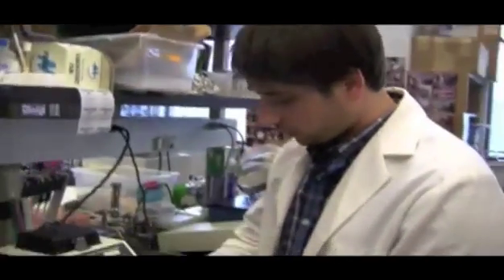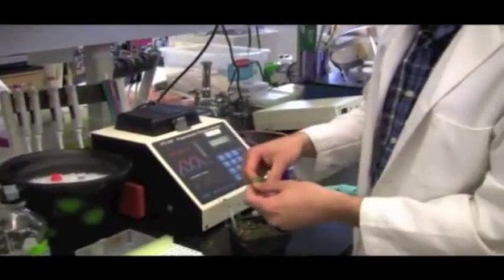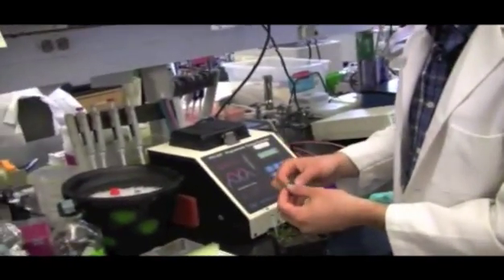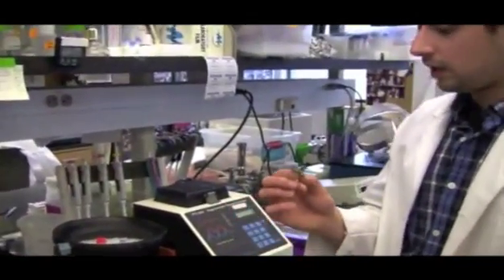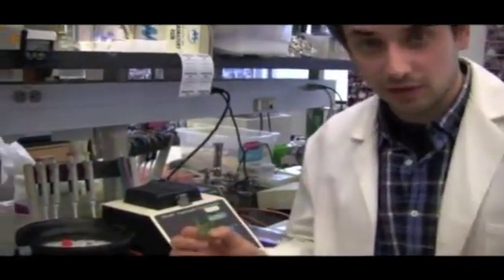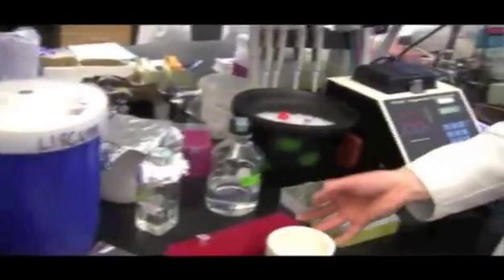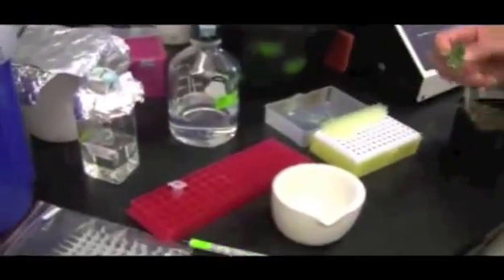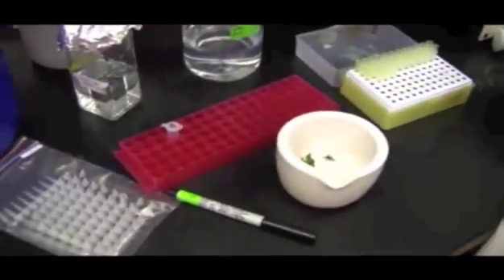So we do that by kind of taking our plant, and we are going to grind it up. So here you have a small Arabidopsis plant, and you guys have seen this before, and I'm going to pulverize it. So we do that in this little device called a mortar and pestle, and these have been around for a long, long time.